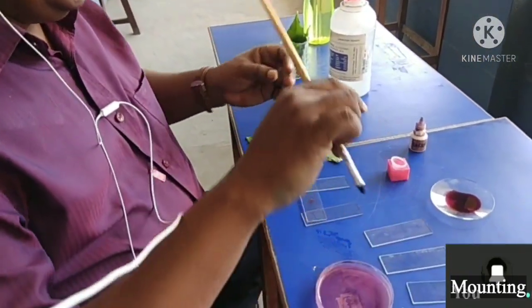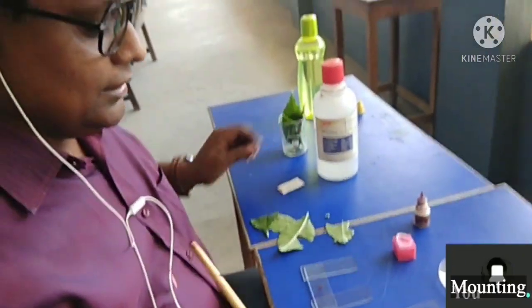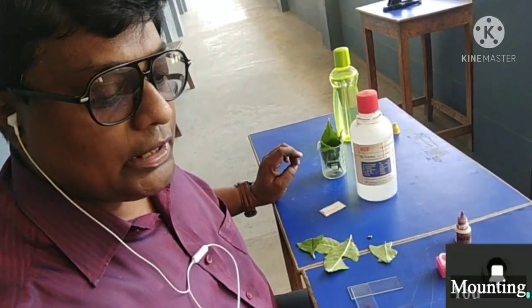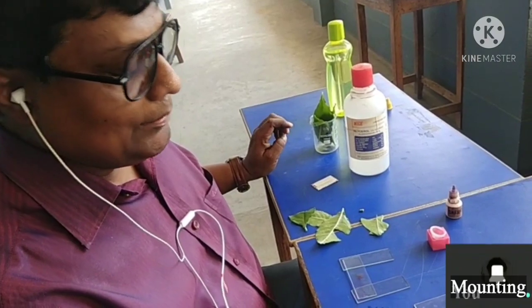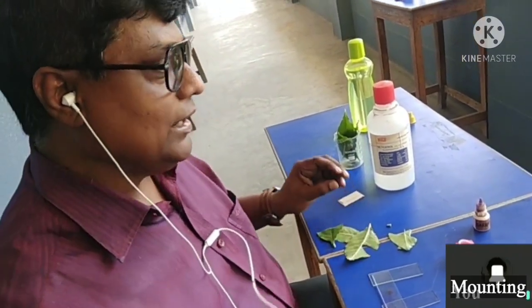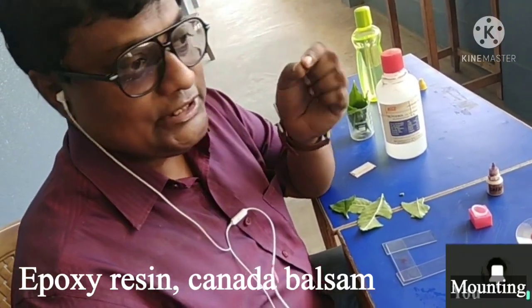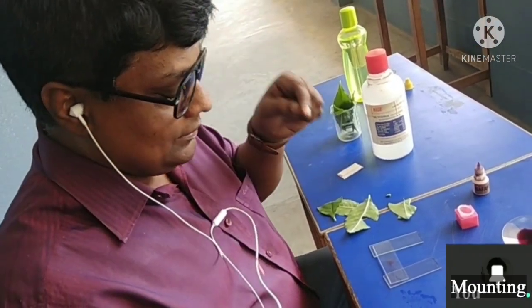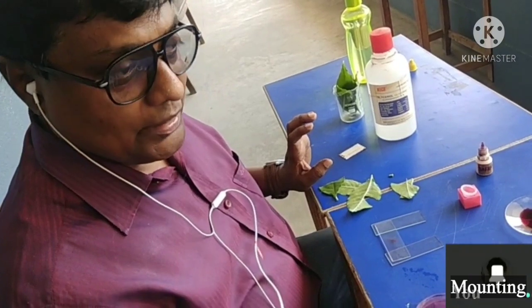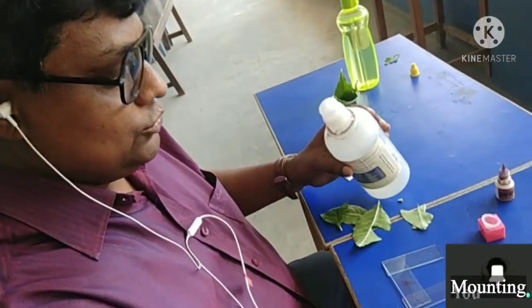As mounting media we are using glycerol — glycerin — because this is temporary mounting. There are two types of mounting: temporary and permanent. In temporary mounting, after watching we can remove it, wash it, and do it again if there is a mistake. In permanent mounting we use epoxy resin or Canada balsam — once fixed, it stays forever. Some permanent slides in labs are like that. Now we will use glycerin.